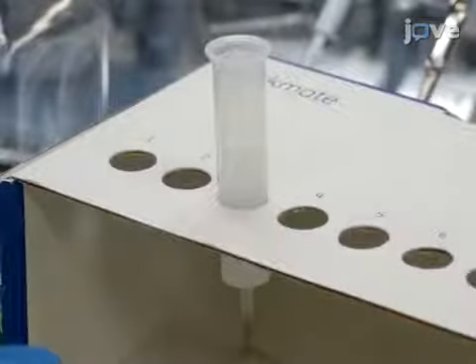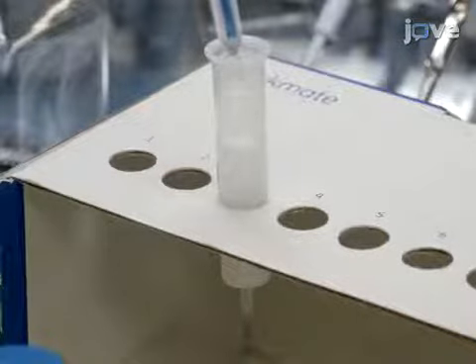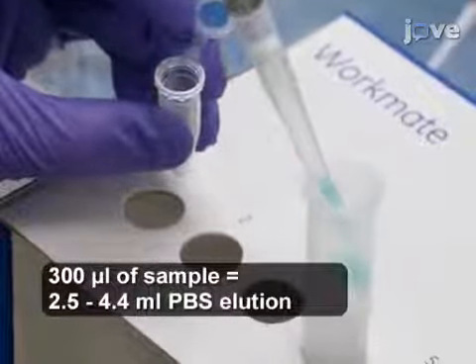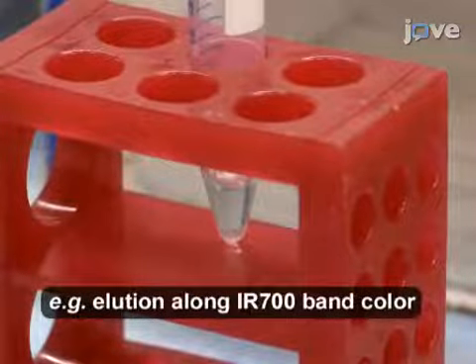At the end of the incubation, wash a PD10 column two times with 15 mL of PBS. Then load the antibody solution onto the column, and purify the mixture by PBS elution according to the manufacturer's instructions.